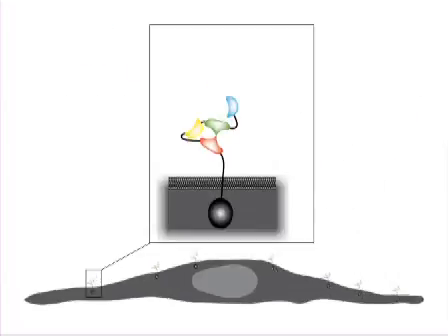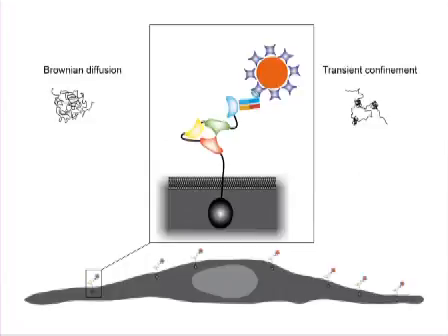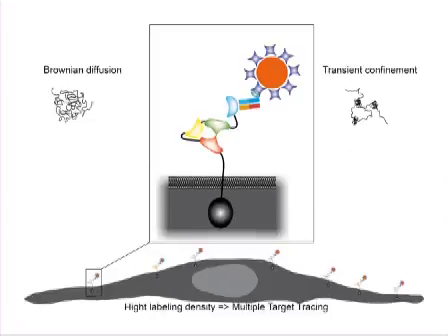Our goal is to provide a comprehensive view of cell surface receptors dynamics. Indeed, molecular trajectories can deviate from Brownian diffusion by being confined within nanodomains, for instance, and this may be the signature of an underlying interaction with, for example, signaling partners or molecular scaffolds.